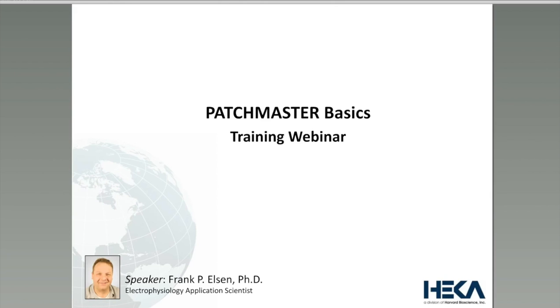Now, the purpose of this webinar is to introduce you to the very basics of PATCHMASTER. This is the HEKA acquisition and analysis software. Please note that I will not go into every little detail of the software or explain every knob and display.